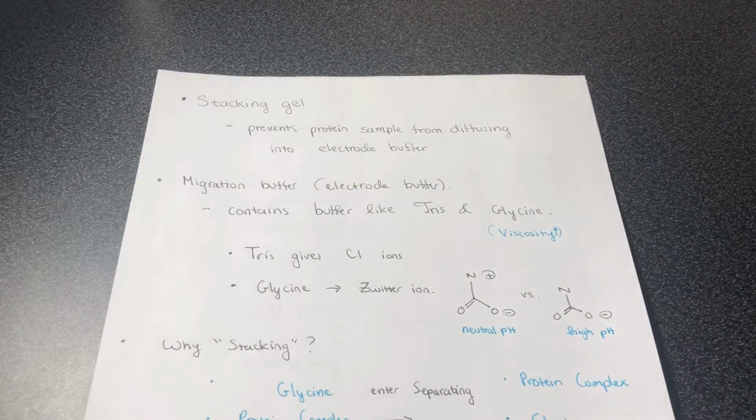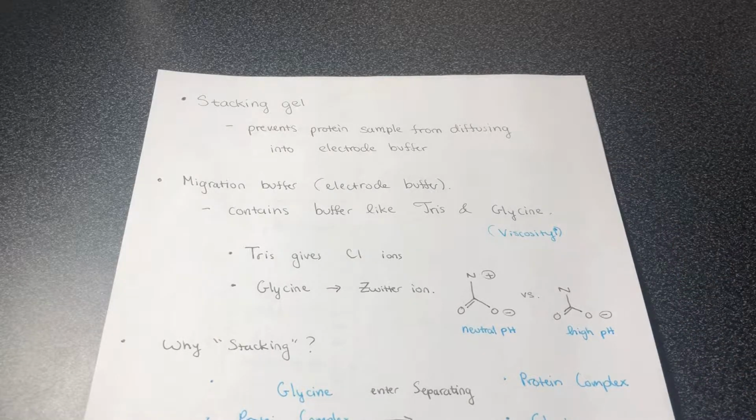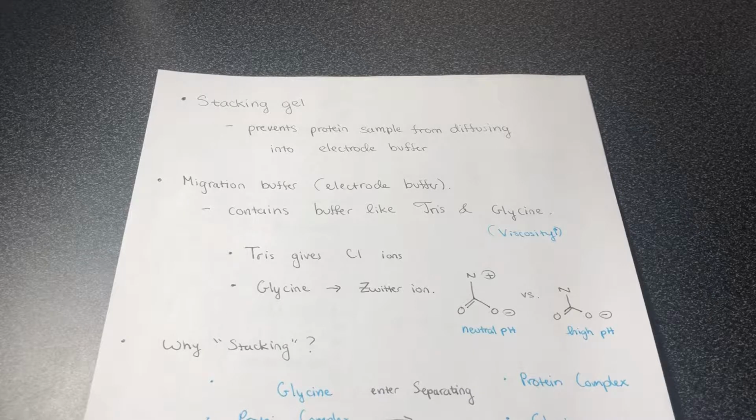And it contains buffers like Tris and glycine. Glycine is responsible for viscosity, and Tris gives you the chloride ions. Glycine is important because it's a zwitterion, which means depending on the pH, it can be neutral, having both positive and negative charges, or when it's high pH, it has an overall negative charge.